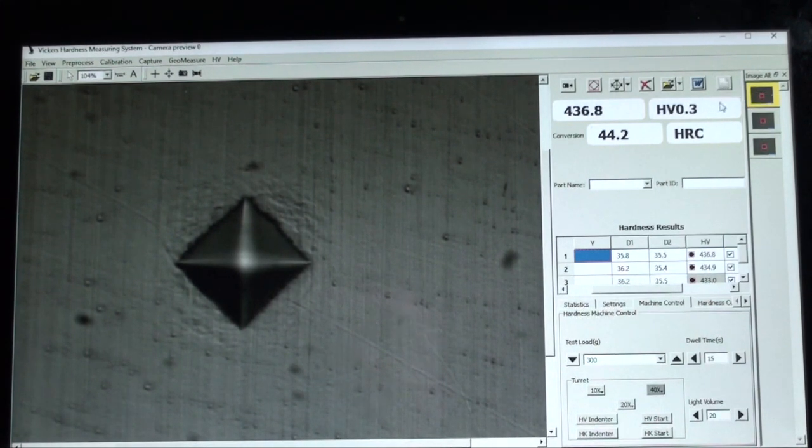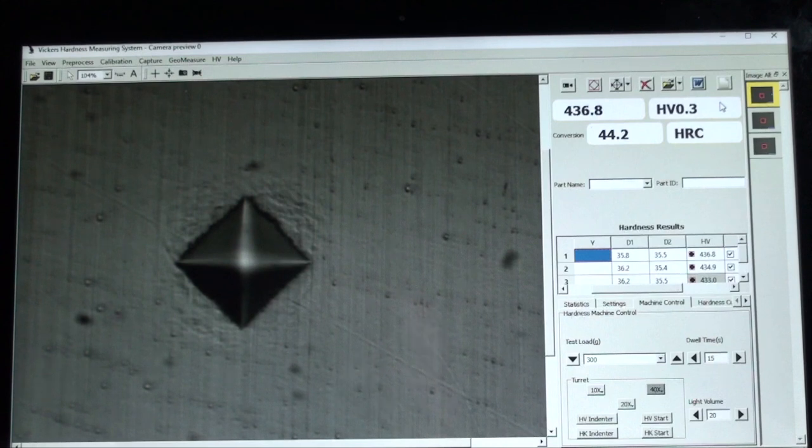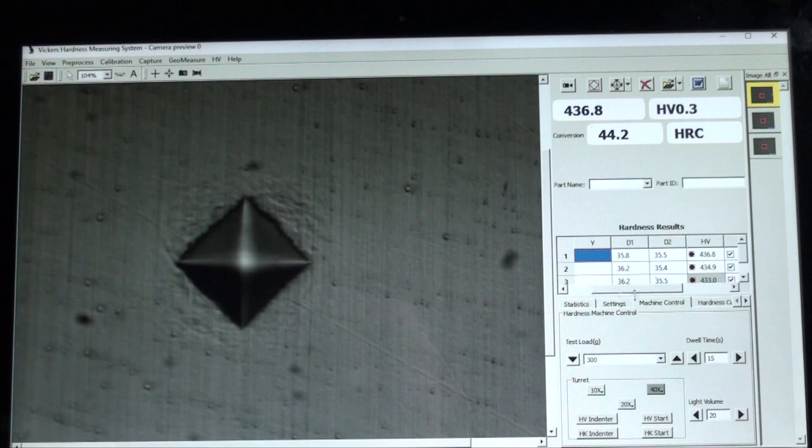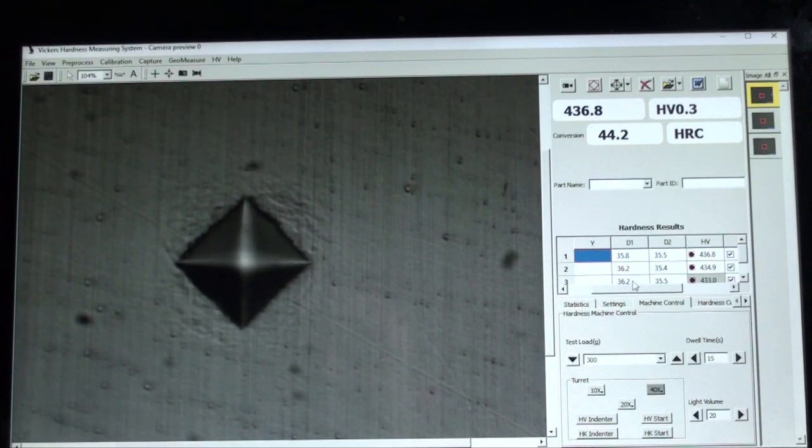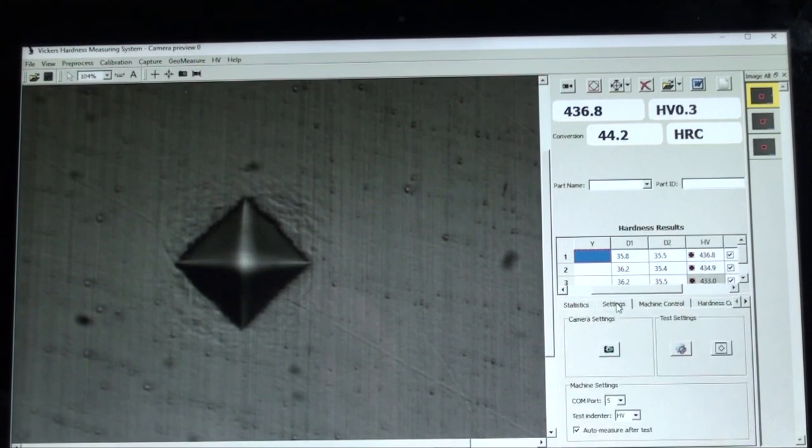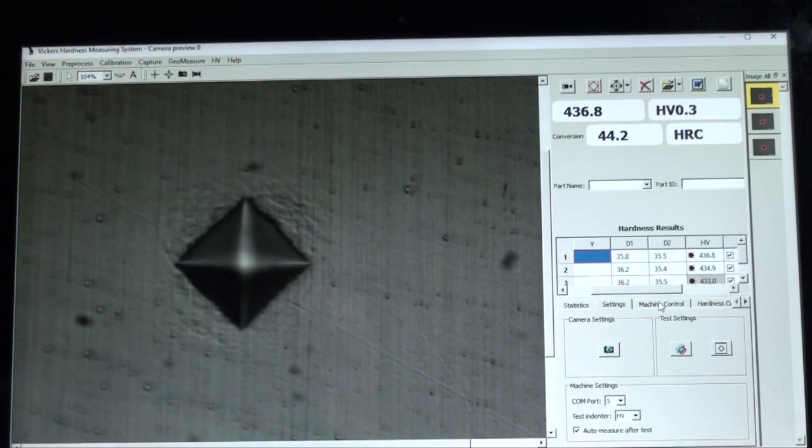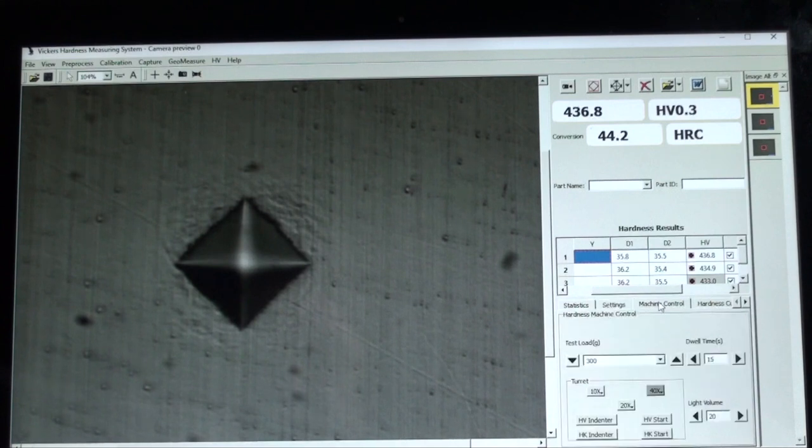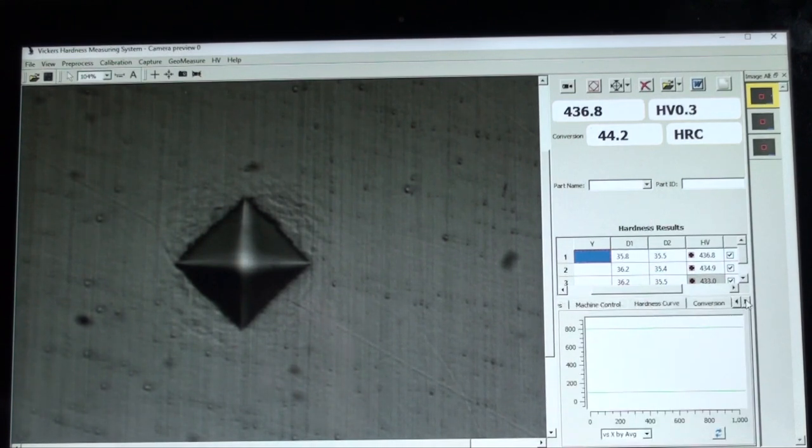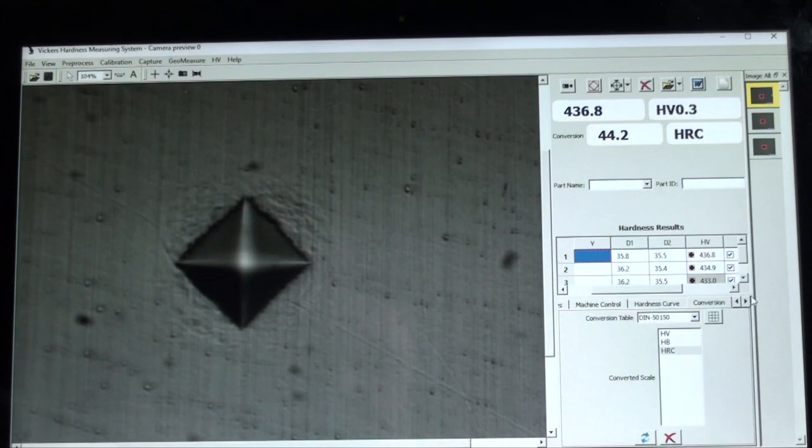And below we have hardness results in a table. And then below that we have settings and parameter changes on the fly in statistics, machine control, hardness curve, conversions, corrections, and others.